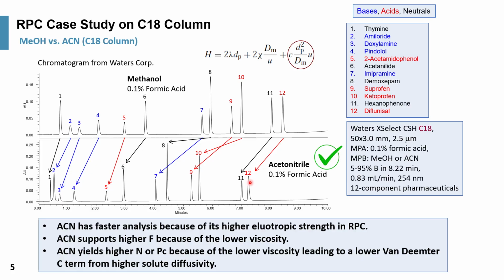And also because it's a stronger solvent, it can support the elution of more hydrophobic drugs or hydrophobic solutes, making it able to support a little wider gradient range.